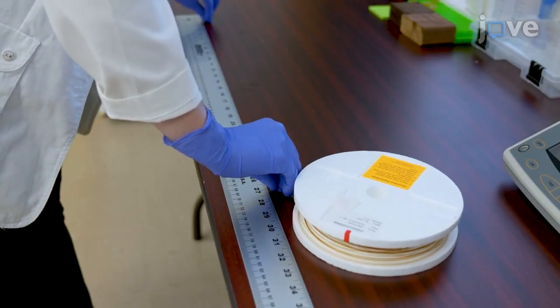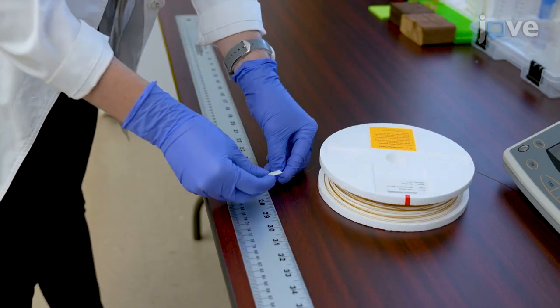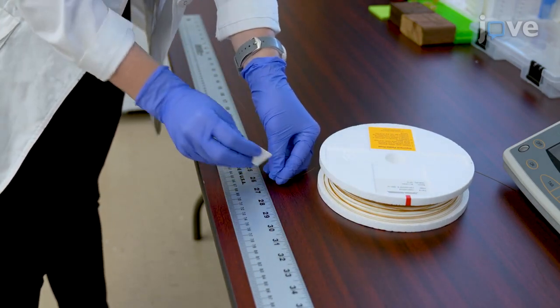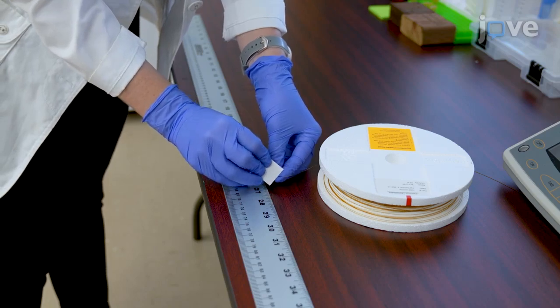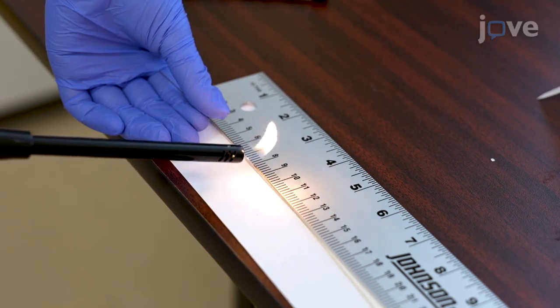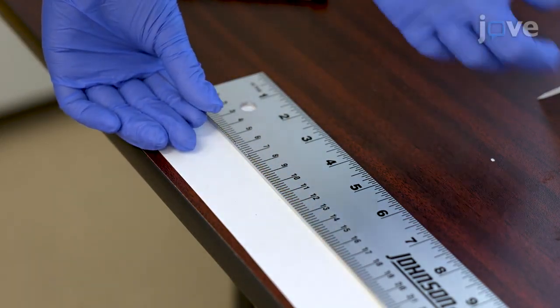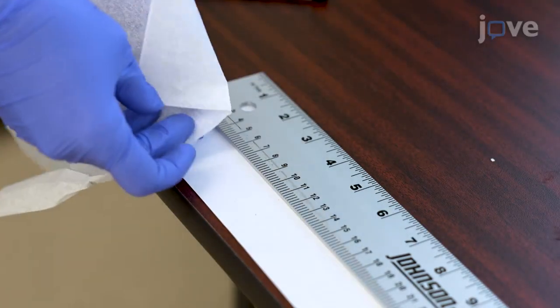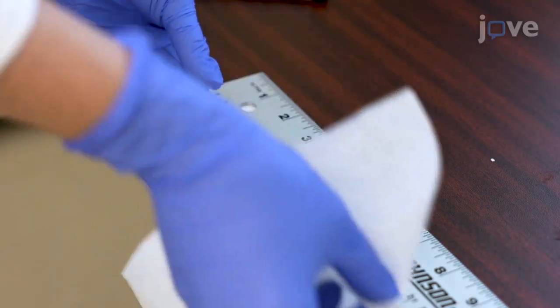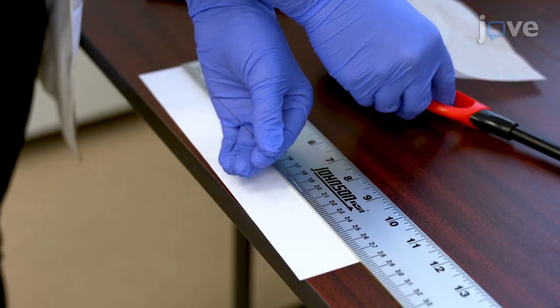To begin, cleave a 250 micrometer inner diameter silica capillary to 27 inches with a silica cleaving stone, checking the ends of the capillary for a clean and straight cut. Create 2 windows of roughly 15 millimeter length. From the lower end of the capillary, burn away the polyimide coating 90 millimeters up to create the photolysis window, and 225 millimeters for the dosimeter window.